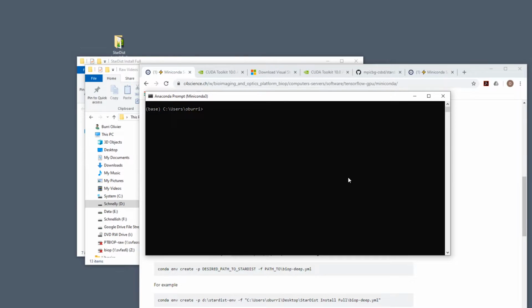And the reason we don't do that is because we don't want this conda environment, which is going to be relatively big, maybe 1 GB or 2, to sit on the same disk as C. Because if you start having multiple users using Anaconda, each environment is going to be a few gigabytes, and it's going to start getting bigger and bigger, and you might overwhelm your C drive. So we make sure that we install things on another disk. In this case, it will be installed on the D drive, which has a much higher capacity. And in case this drive gets full, there's no problem with Windows.